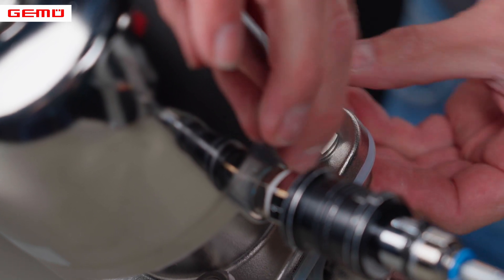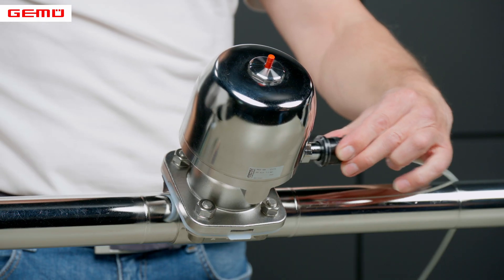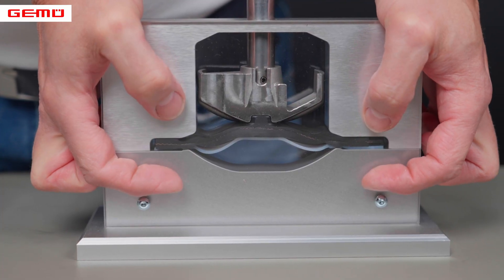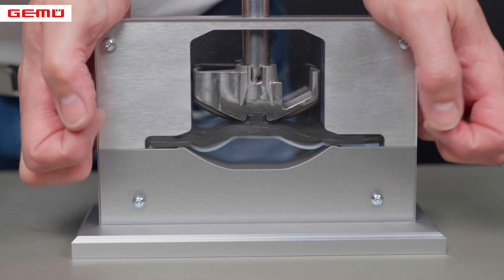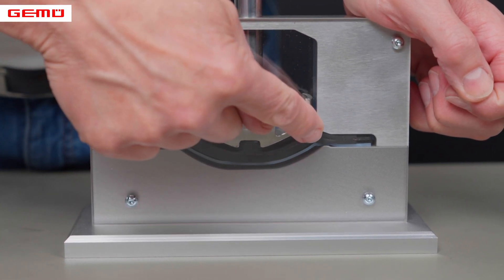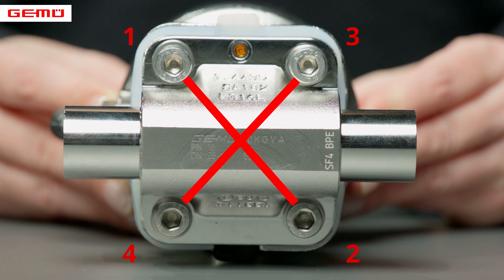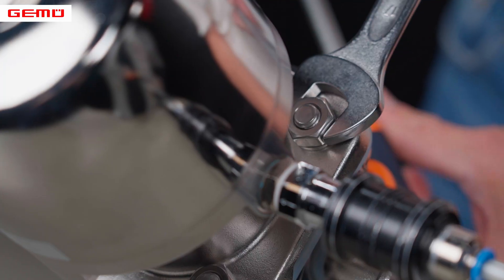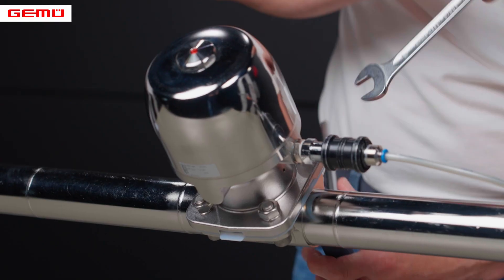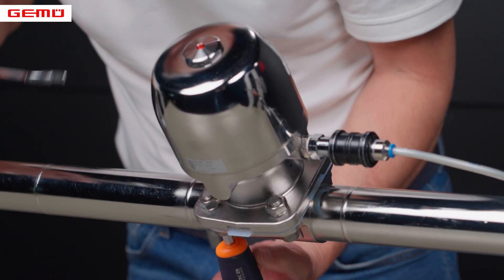The valve actuator must then be moved to the closed position. Manually operated actuators are moved to a half closed position. As the screws are not yet completely tightened, the diaphragm and actuator can center themselves on the valve body when the valve is closed and the diaphragm is placed under low stress. The screws are tightened evenly crosswise in several steps until the PTFE diaphragm face is flat and parallel to the valve body. This ensures correct assembly of the GIMU code 5M diaphragm.